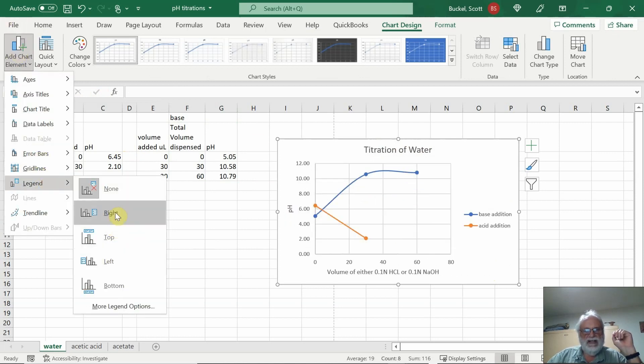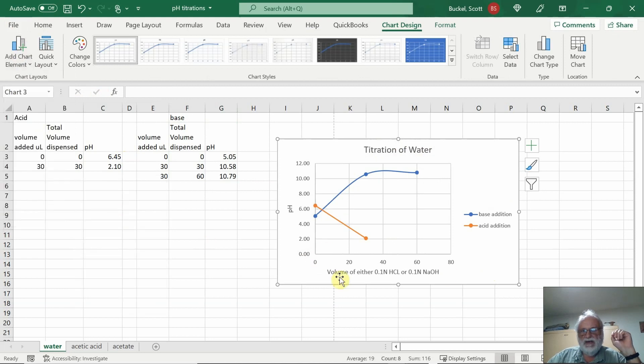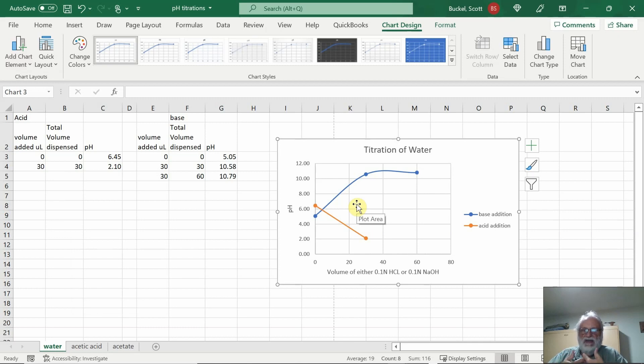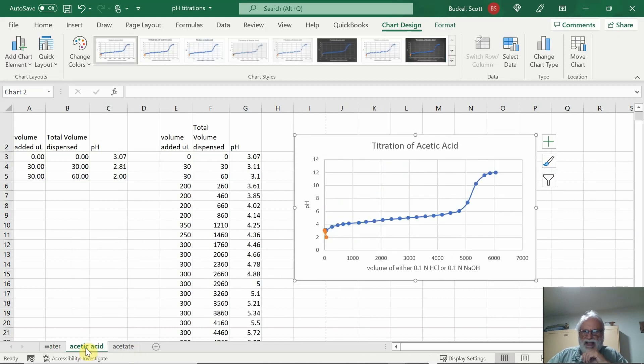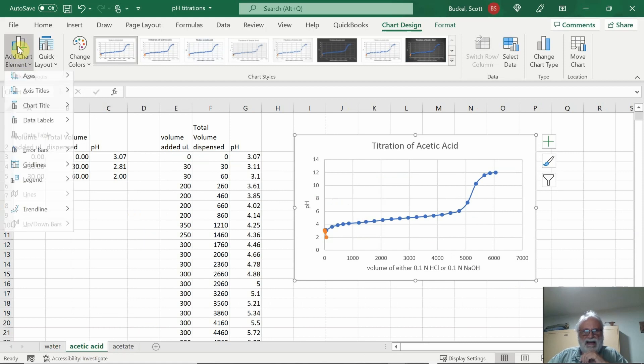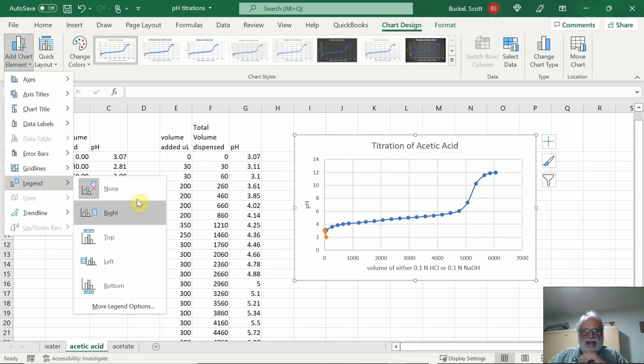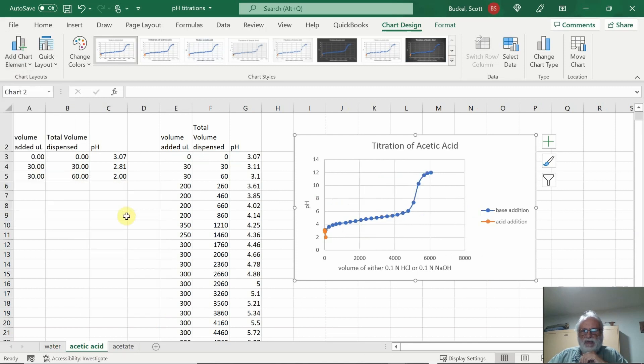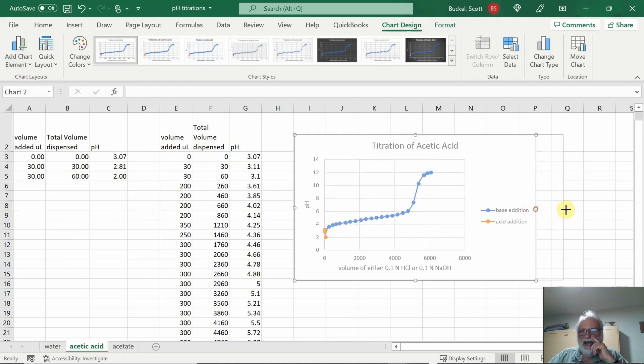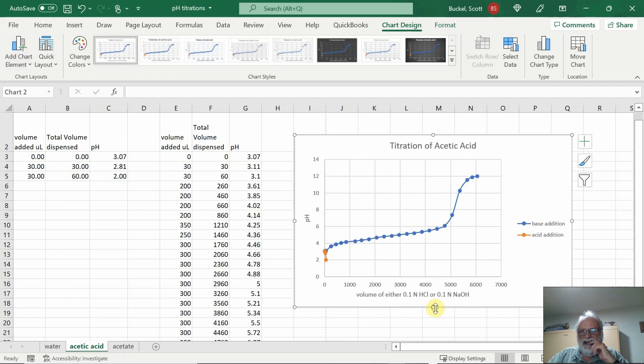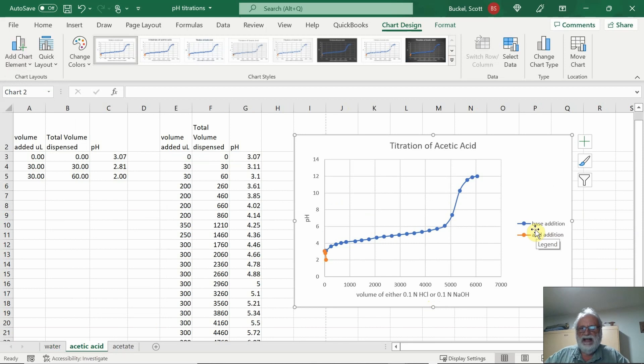I always think it's good to have a legend present. Particularly if you have more than one line on the graph, then a legend is necessary. If you only have one line on the graph, then a legend isn't necessary. But as soon as you have two lines on the graph, I think you really need to have a legend. And did I forget to put a legend on this one? Yeah, I did. So let's go ahead and add element, legend. And I usually do it to the right. I know some people like to add it to the bottom. I seem to always like it to the right. I've just generally done it in the past.